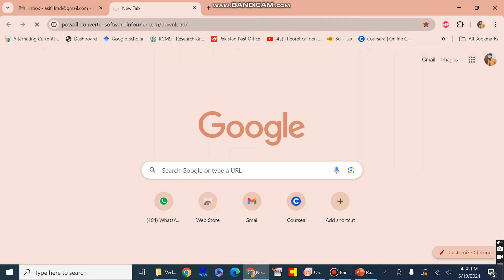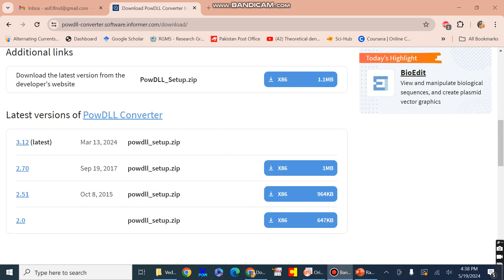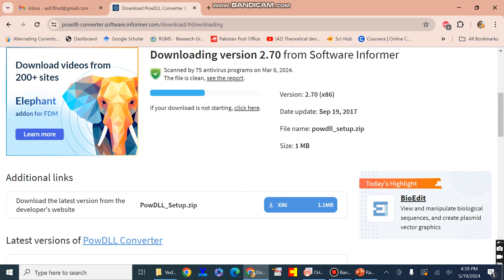Press the first result icon in order to download the software. There are certain latest versions available which can be downloaded free of cost and easily, with a file size of less than 2 MB or maximum 1 MB. Just press the download button in order to download this PowDLL software.